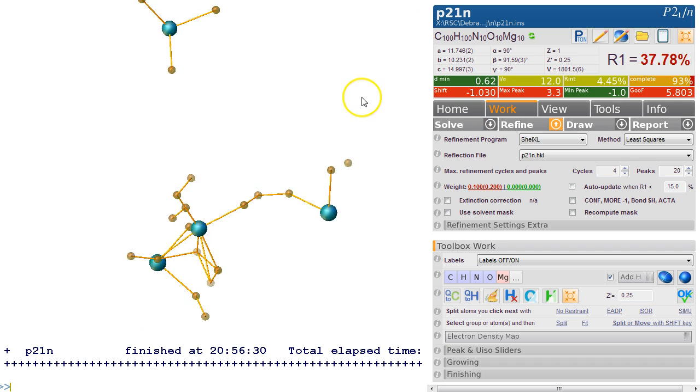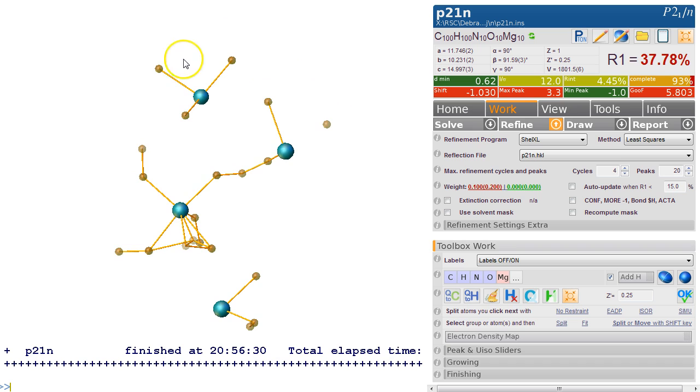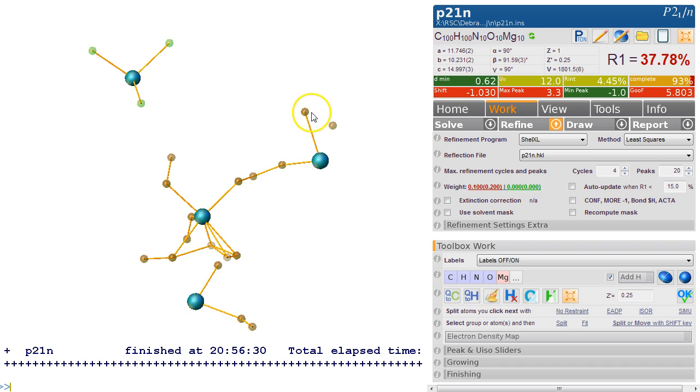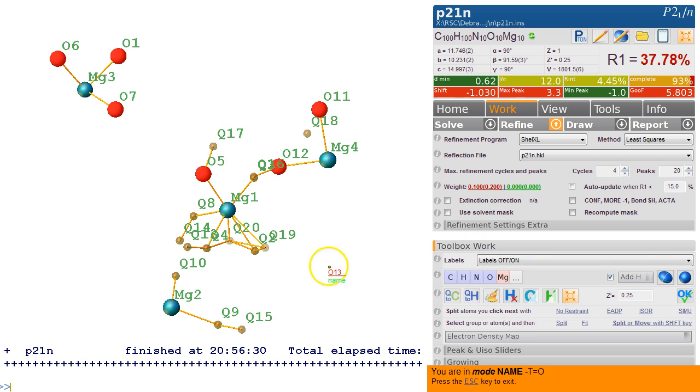We actually got some atoms here and some connectivity. So these ones are probably oxygens if that's magnesium. We select these oxygens here, we select these atoms and then we make them oxygen.